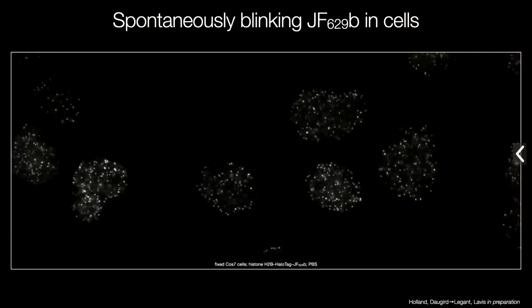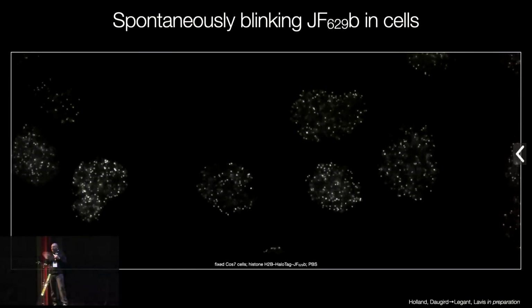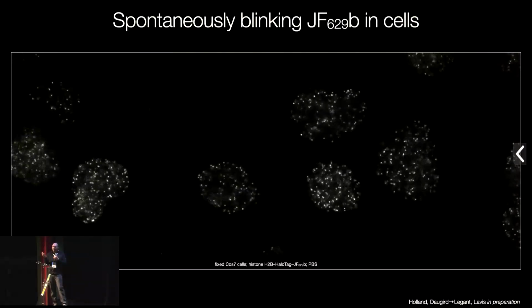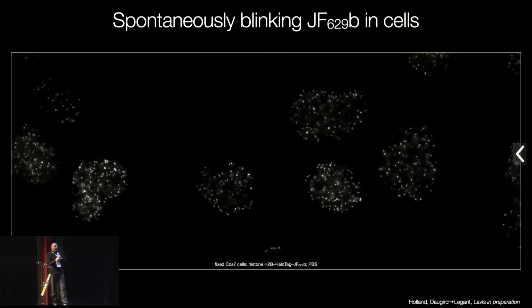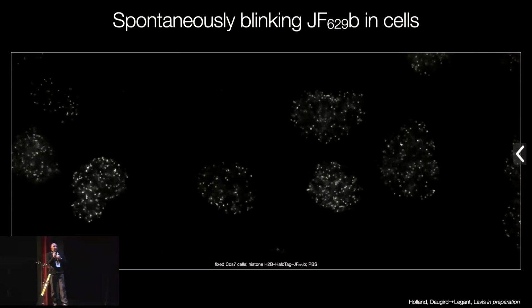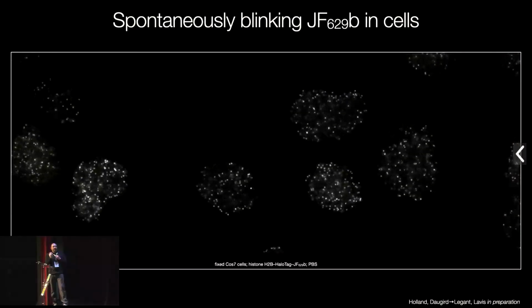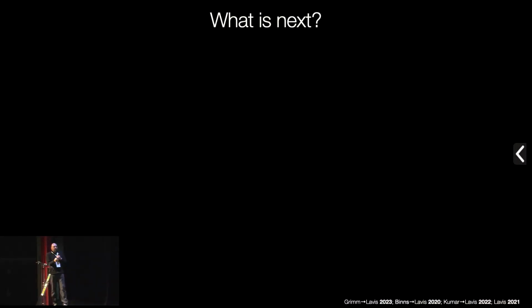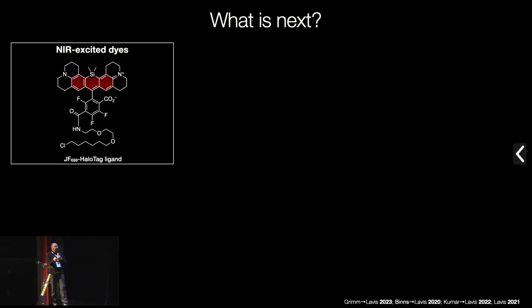This is from Wes Legant's lab. This is just in PBS buffer. There's nothing really going on here. It's fairly straightforward to use. And so we're about to put this on bioRxiv, but if someone wants to try it out, we're happy to send you this whole panel, and then you can figure out which on-off ratio is going to be useful for your particular structure. All right, so what's next?